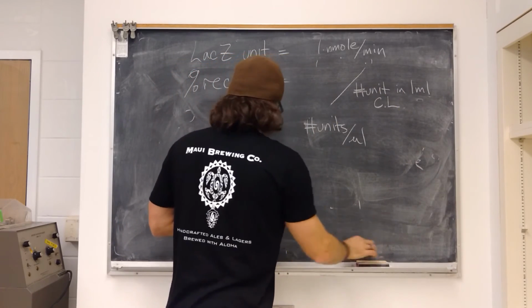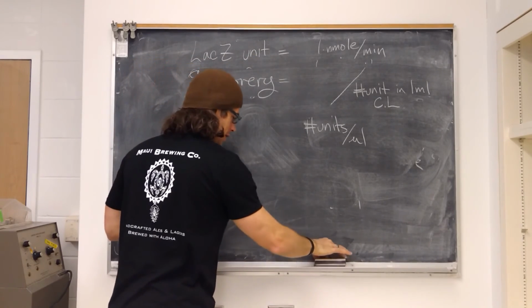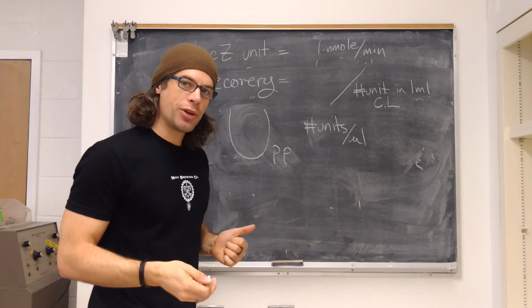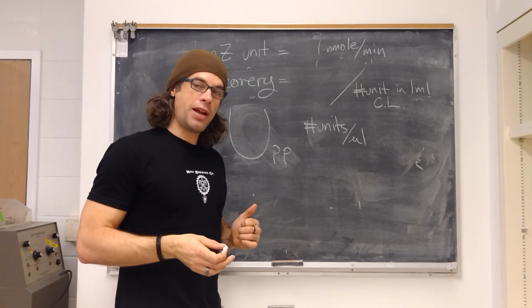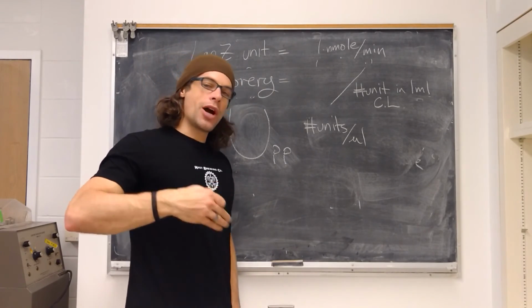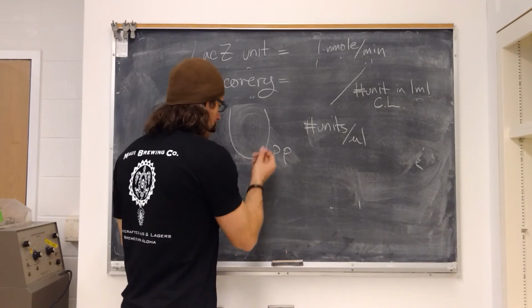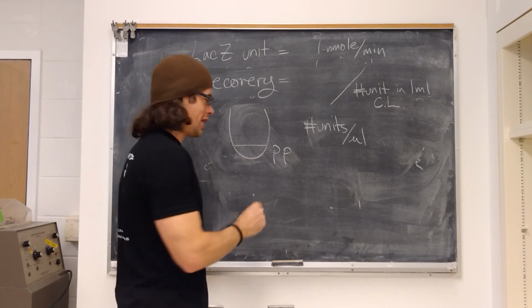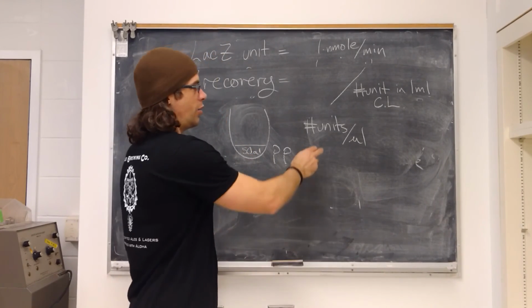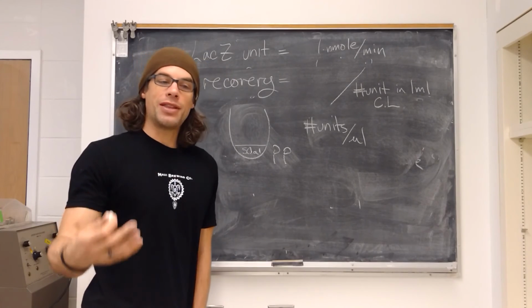Now, you can very easily change this up. I'm just going to erase that. Let's go back to our purified protein. You assay 10 microliters of purified protein, determine the number of units in that, divide it by 10, and get the number of units per microliter of purified protein. We then go back to work out how many units total we actually got in our aliquots to freeze down, or we used. Well, for that, we have to go back to the volume of our purified protein, which in this case was only 50 microliters. So whatever value you find here, multiply it by 50. That was the number of units you had at the end of your recovery process.